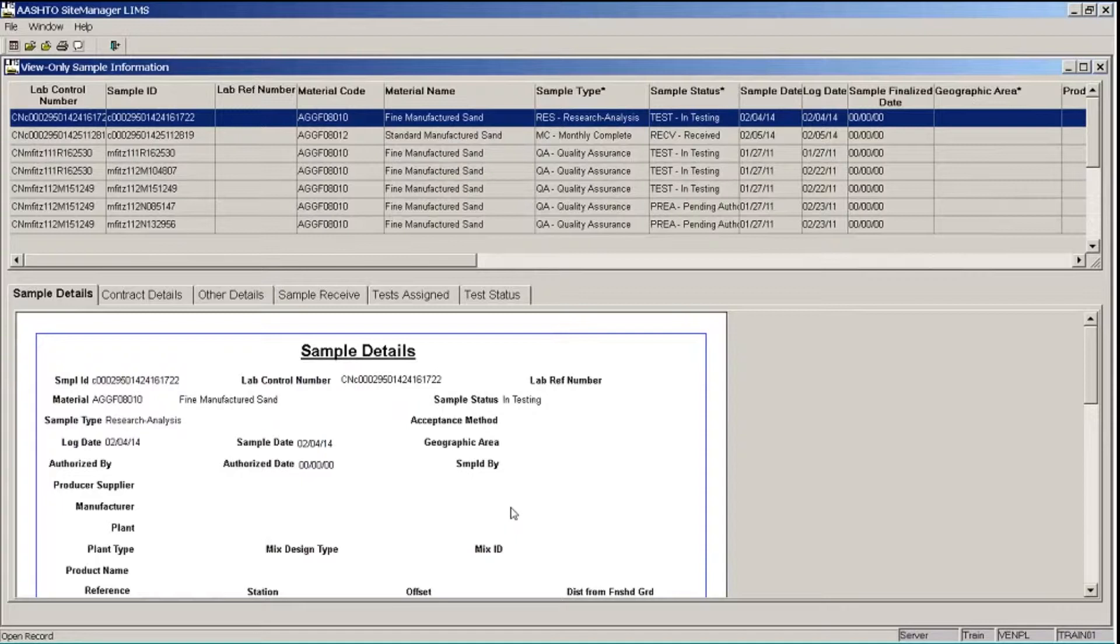So let's talk about how to view information. The upper pane of this window lists all of the sample records that meet our filter criteria that are associated with my organization. Whatever is highlighted in the top part of the window, the details for that particular sample record will be shown in the bottom part of the window.